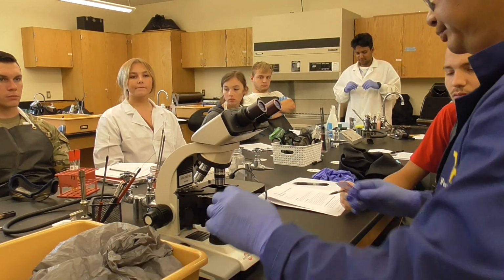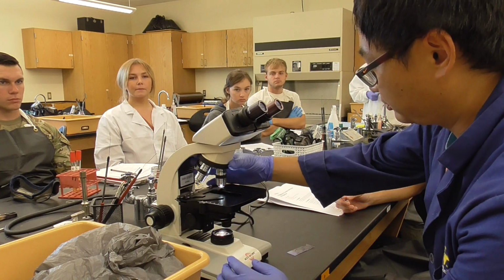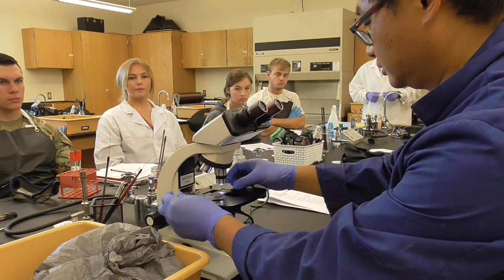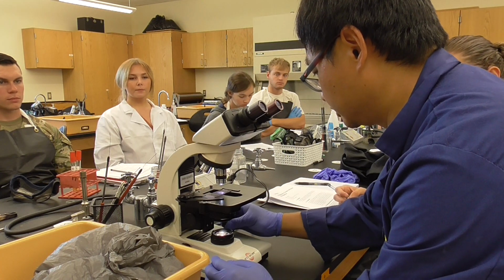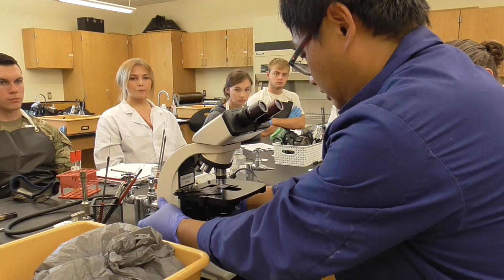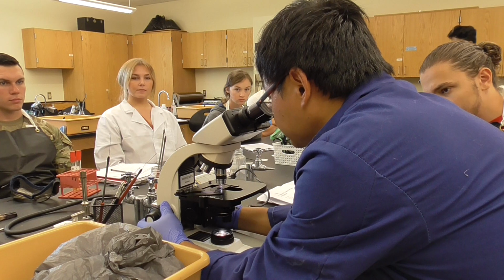Let's do this. First of all, turn it on. Stage down. And we're going to put the 10x here. So what we do, we put the slides there, and we move a little bit. Make sure the iris diaphragm is at 10. Okay, so we're gonna go down, go down, go down to the stage, you cannot move. Then you're gonna go up a little bit.